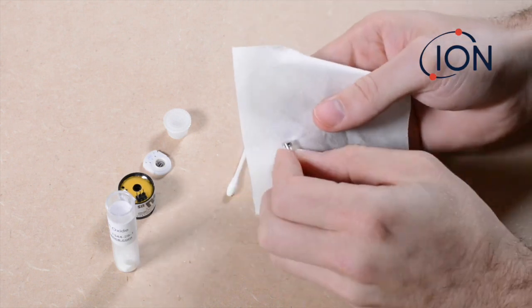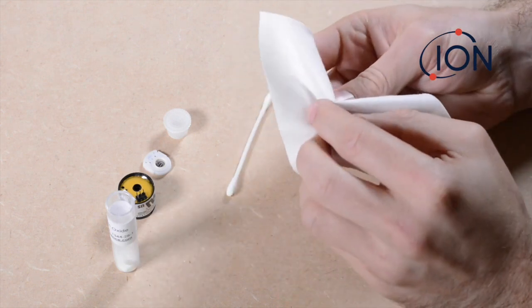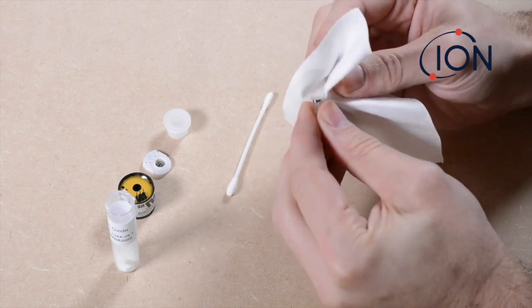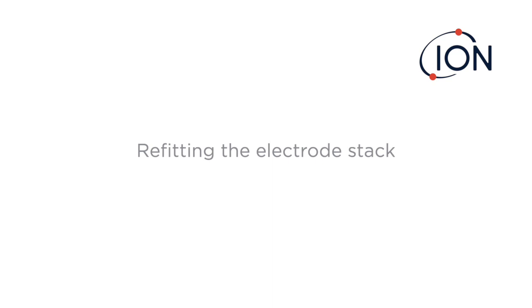Once you can hear a light squeaking sound, this is an indication that the lamp window is clean. Any excess powder on the lamp window can be removed either using a lint-free cloth or by blowing clean, dry, and oil-free air across the lamp.